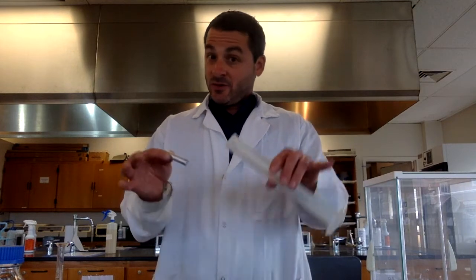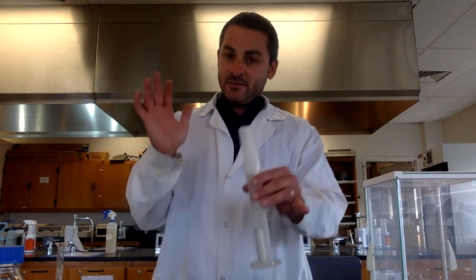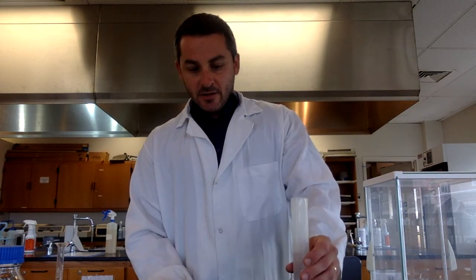Now, I'm going to carefully, without spilling any water or breaking anything, put this piece of metal in here. So, diagonally, slide it in there. Make sure there's no bubbles. Now the volume is increased. The amount that it increased is the volume of the metal.